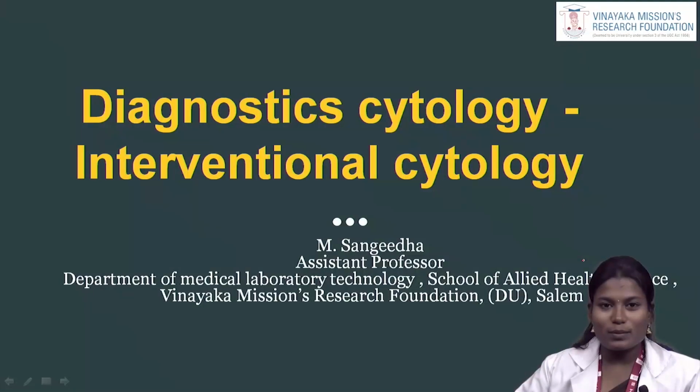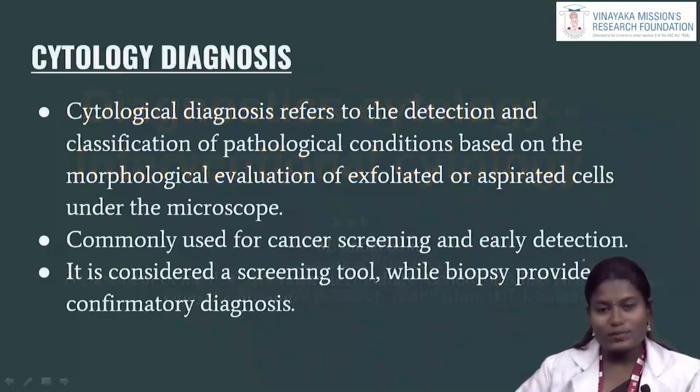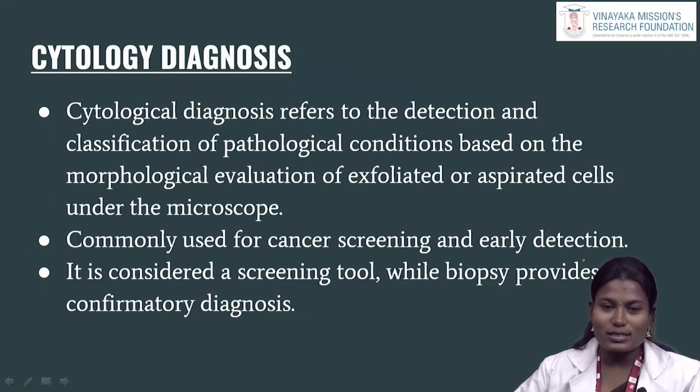Today we are going to see about diagnostic cytology, in that interventional cytology. Cytology means the study of cells, for the purpose of detecting early-stage malignant cells and abnormalities of the tumor cells and squamous cells. Cytology diagnosis is the study of shed cells under microscopic conditions. It involves classification of pathological conditions and morphological evaluation of the exfoliated cells and aspirated cells, which we see under microscopic examination.